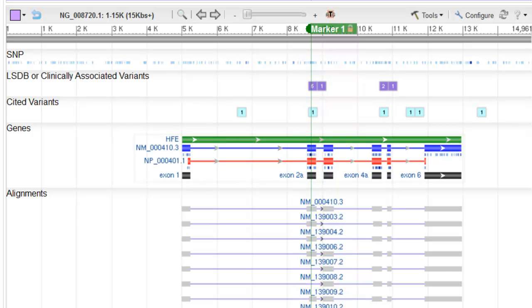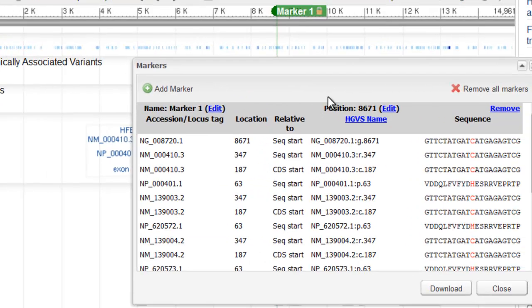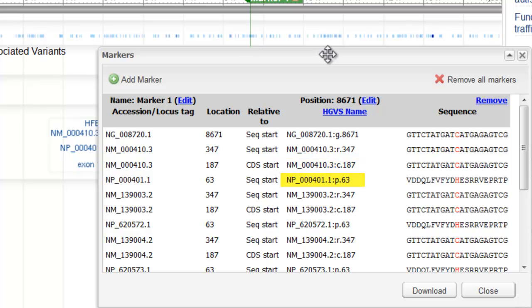Next, right click on the marker and select Marker Details. This window reports the location of the marker in multiple coordinate systems: the start of the RefSeq gene, the start of the cDNA, the nucleotide of the initiation codon on the cDNA, and the amino acid sequence.